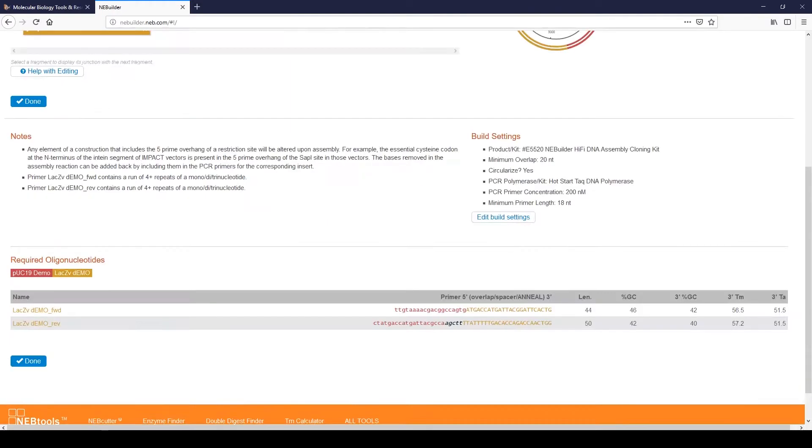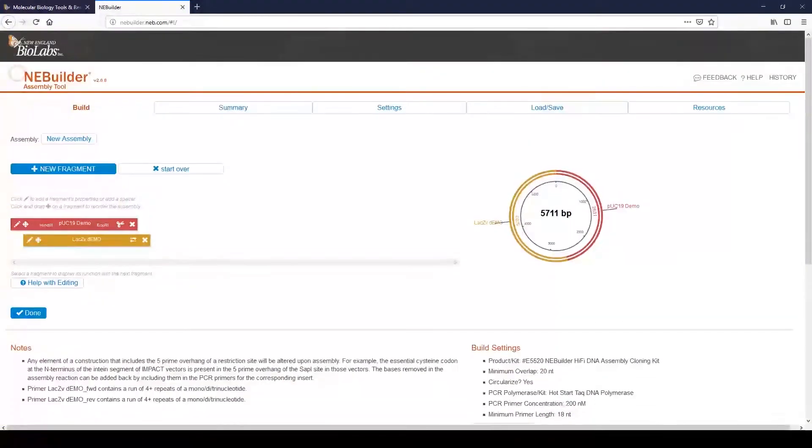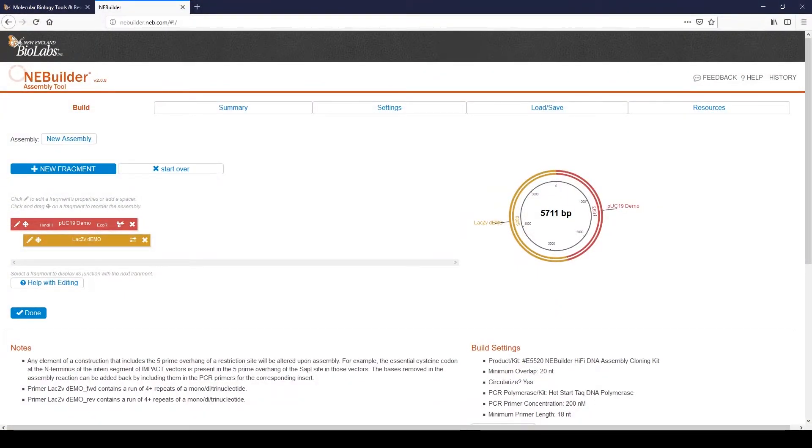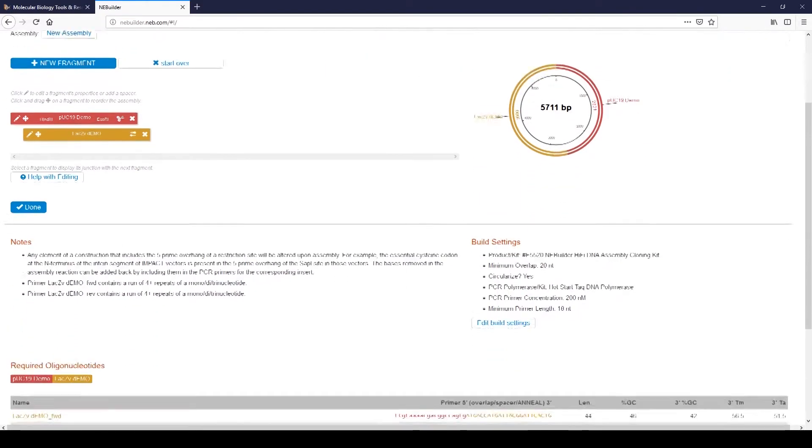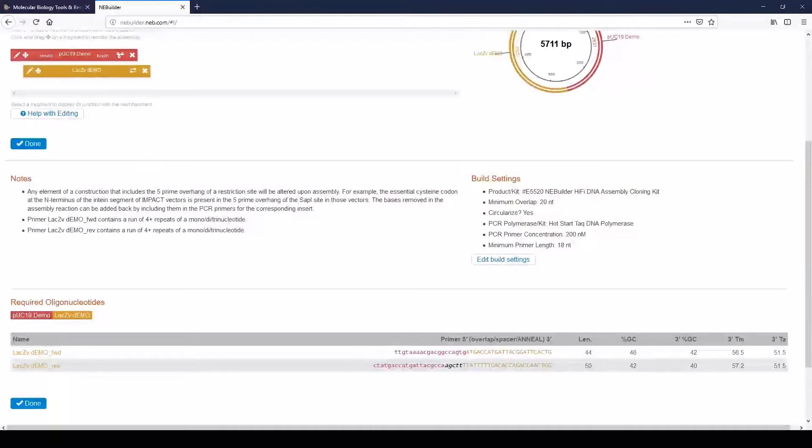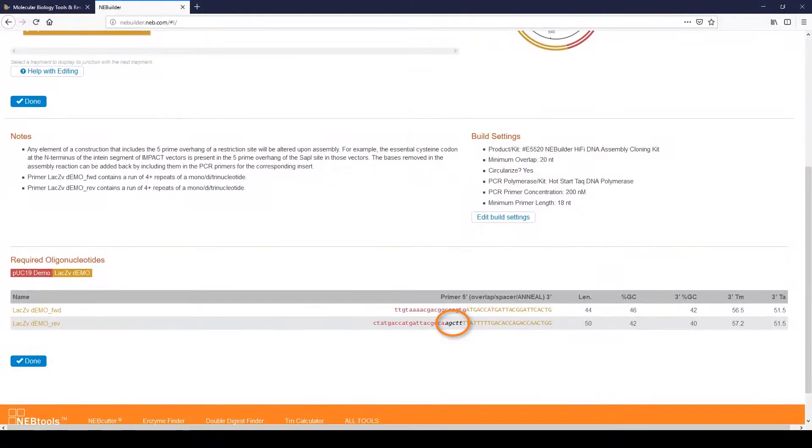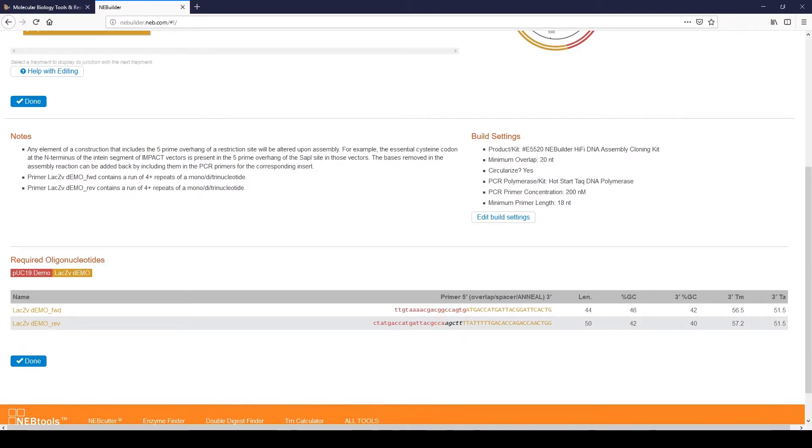On the next screen, we will see a simple map of the plasmid vector and the LAC-Z insert. The 5' end of the LAC-Z insert is joined to the ECOR-1 site. The 3' end of the LAC-Z insert is joined to the HINDI-3 site. Scroll down to see the required oligonucleotides. The sequence in black indicates the additional sequence added to regenerate the HINDI-3 site.